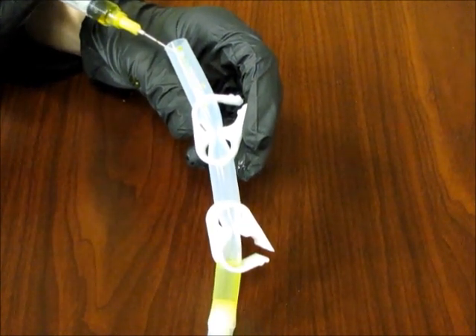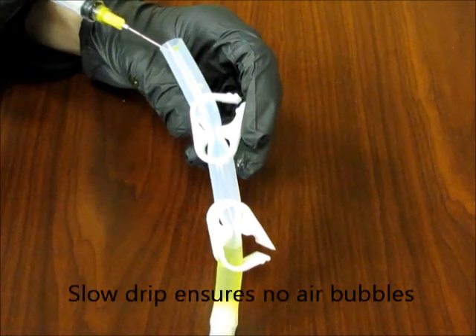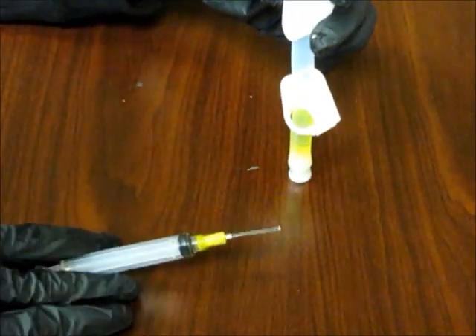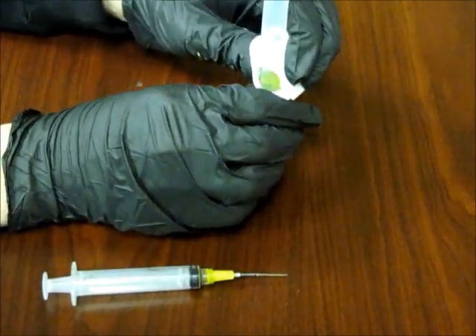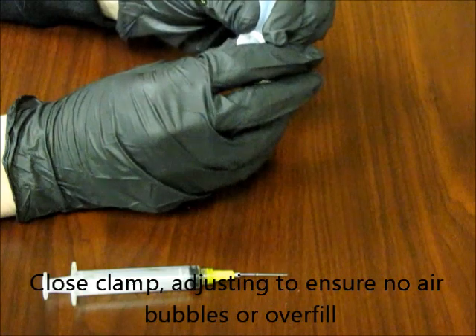A slow pour ensures that there will be no air bubbles in the bottom chamber. Once the pour is complete, you may begin clamping the chamber, carefully ensuring that no air bubbles or overfill are present.